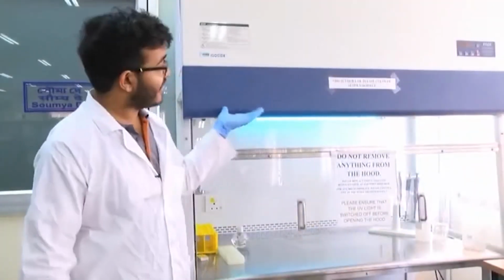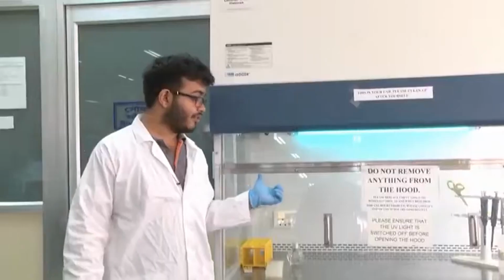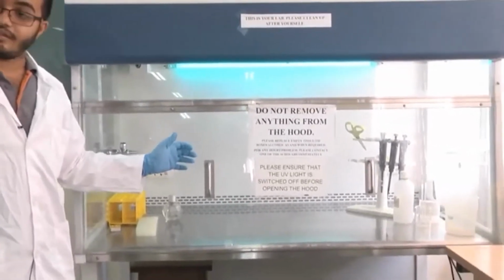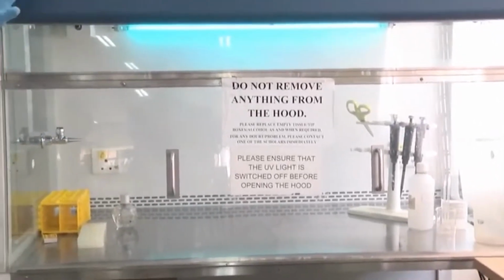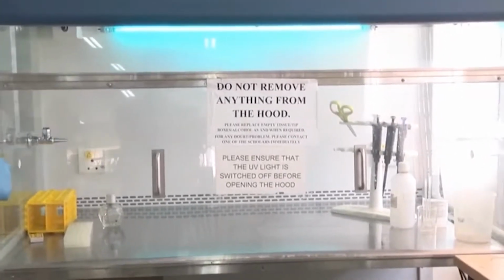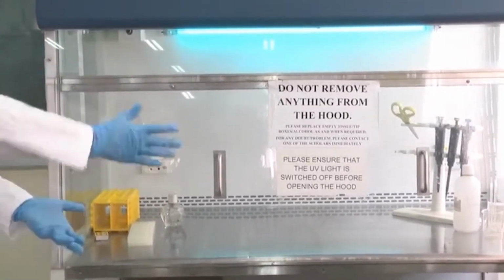So, the instrument that I have behind me is a laminar airflow cabinet, and we are going to use it when we work with bacterial cultures and need to maintain a high amount of sterility. It maintains a positive pressure airflow which prevents air from the outside from entering this region. Once I remove this lid and switch it on, there will be a positive pressure airflow blowing, preventing the normal air from entering.